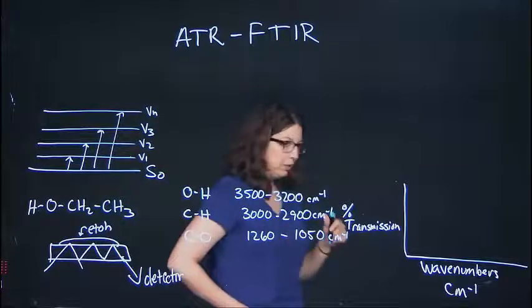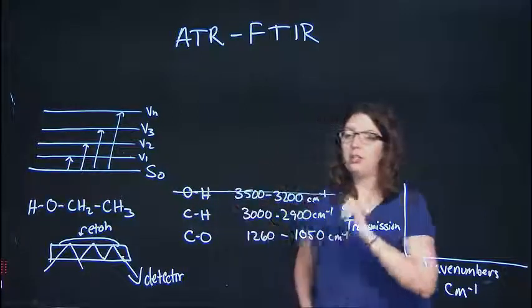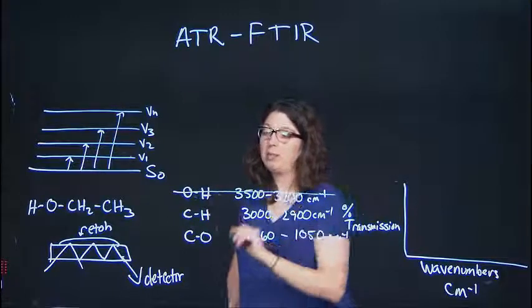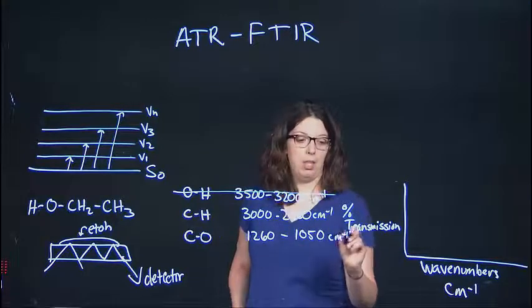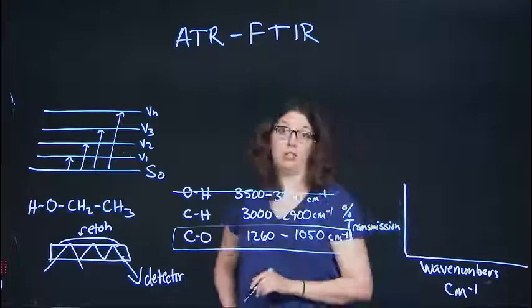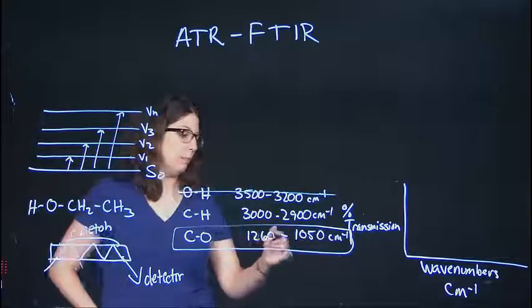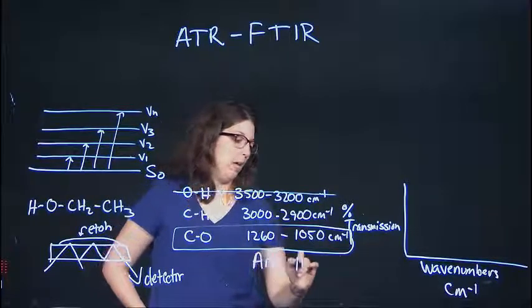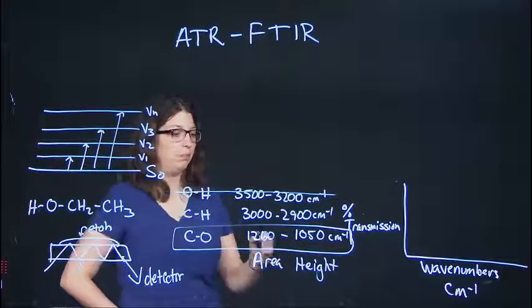Now, if we think about an aqueous solution of ethanol, we can't monitor OH. And the reason is that we're in water, okay? Aqueous. So there's going to be tons of OH. And the stretch is not going to be dependent on the concentration of ethanol. The thing that's most going to be dependent on the concentration of ethanol is this CO stretch. Okay? So these are the bands that we're going to monitor. Make sure you know exactly where in the spectrum the CO stretch is going to occur, because we're going to measure the area and the height of the bands present in the CO stretch. Okay, stretching region.